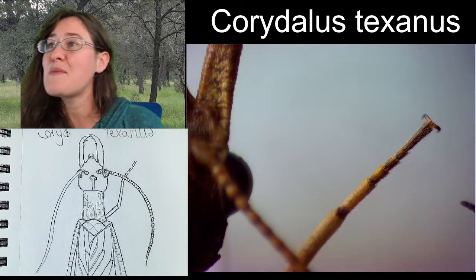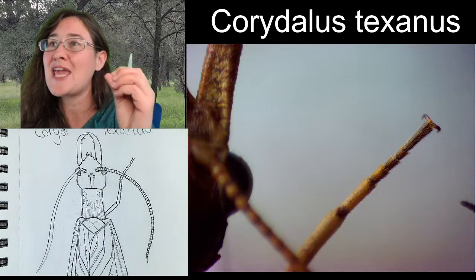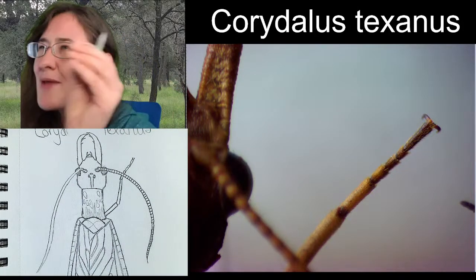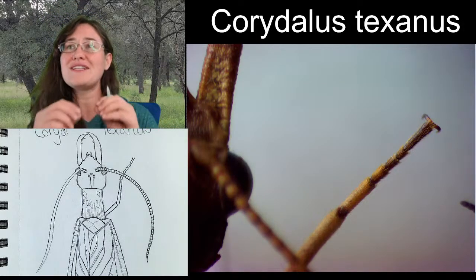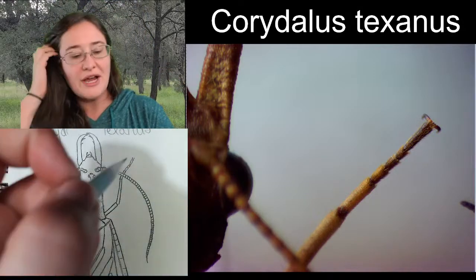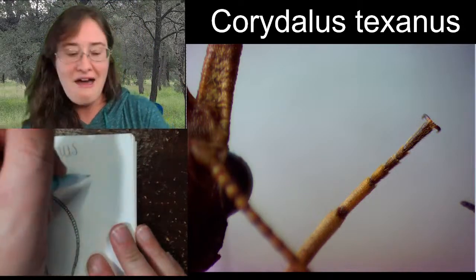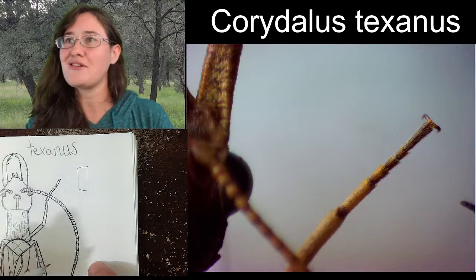I was thinking about this recently. Entomologists haven't come up with names for the different shapes of tarsal segments, and I feel like there are very distinct shapes. After sketching them so regularly, you have the rectangle, where they're all rectangular all the way down.